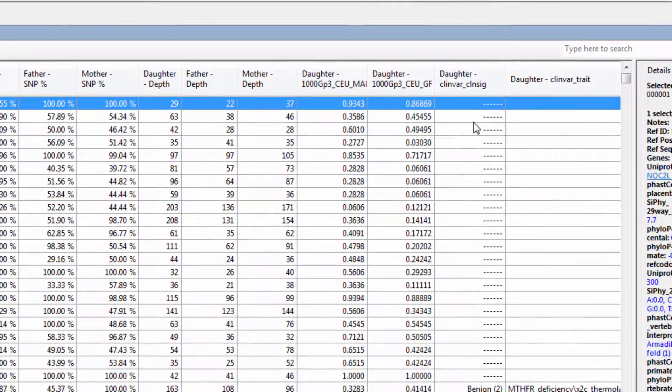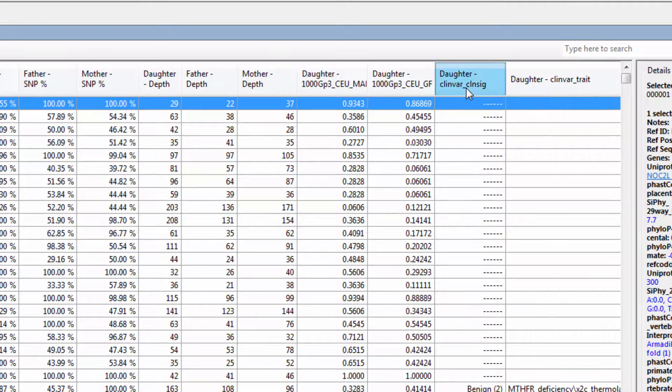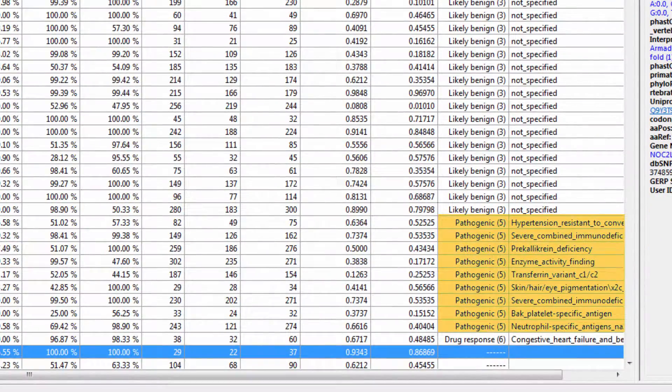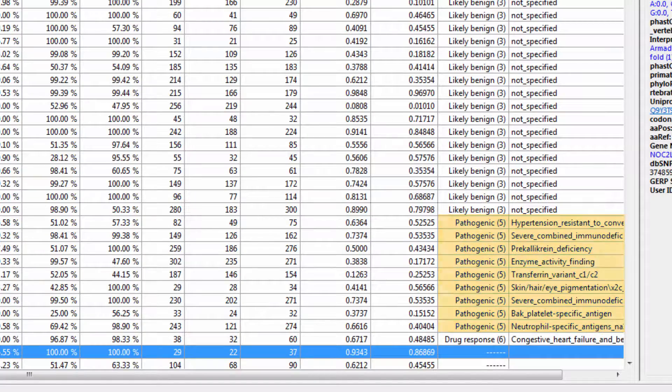So, for example, if I sort on this ClinVar Clinical Significance column, I see variants that are likely pathogenic sorted together.